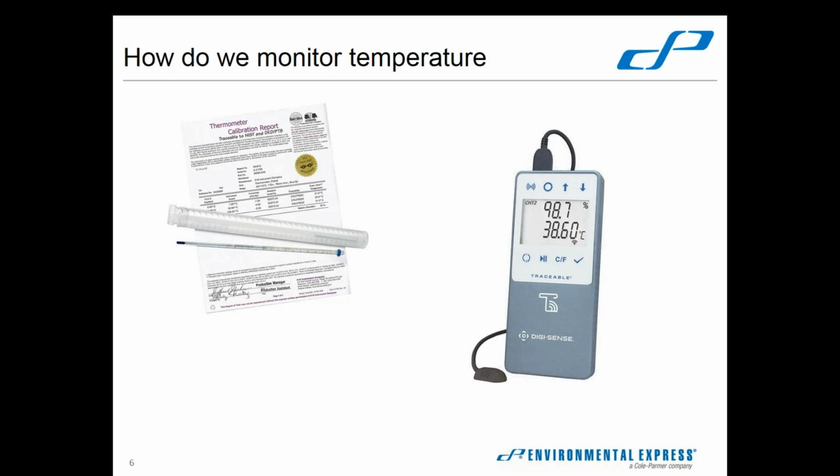And then all the other thermometers that you're using throughout the lab are checked against those NIST thermometers on a regular basis. It may be annual. I think it's at least annual for everyone. I know you may do more regular checks on those as well.